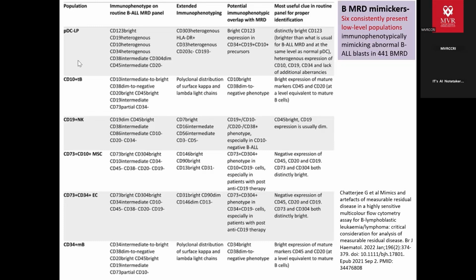Hemodilution is another factor. One important advantage of flow cytometry is that we can assess the sample quality. There are parameters which will help us to see whether the sample is hemodiluted or not. Normally in a marrow we see some populations which are indigenous to marrow, which are not found in normal peripheral blood, like the mast cells, the hematogones, the myeloblasts. All these are found in the marrow. So when I see these cells in adequate percentage, I know this is representative of marrow. And when the granulocyte percentage is more than 50%, which is not normally seen in the marrow, there are criteria for us to say whether the sample is hemodiluted or not.